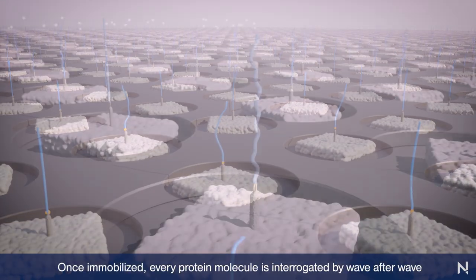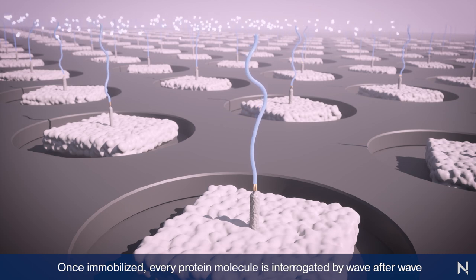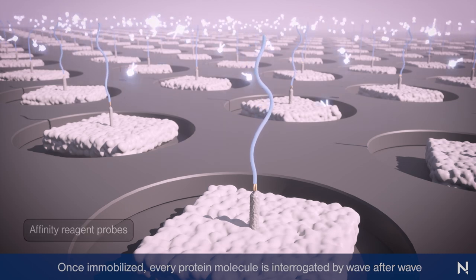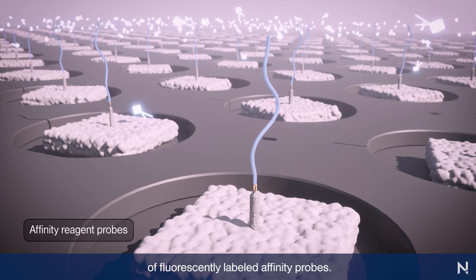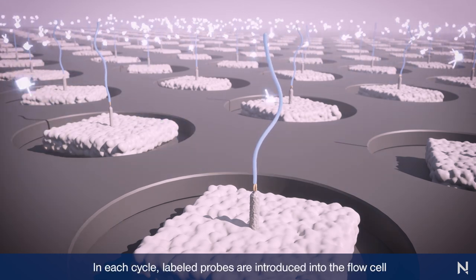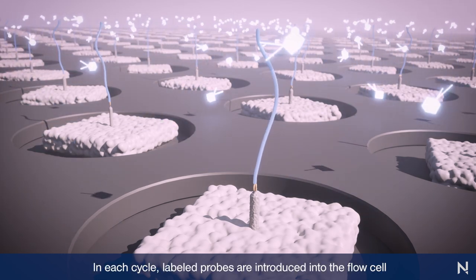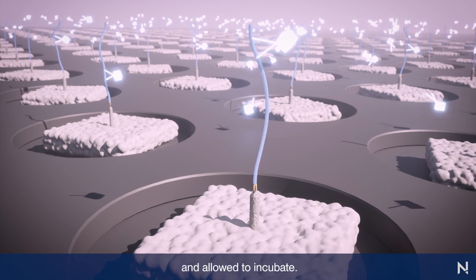Once immobilized, every protein molecule is interrogated by wave after wave of fluorescently labeled affinity probes. In each cycle, labeled probes are introduced into the flow cell and allowed to incubate.